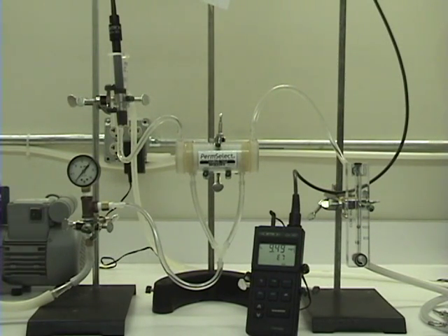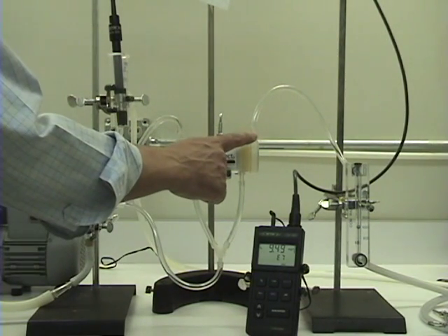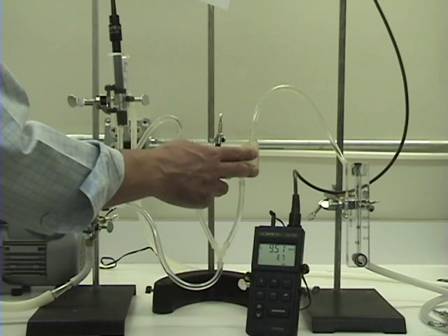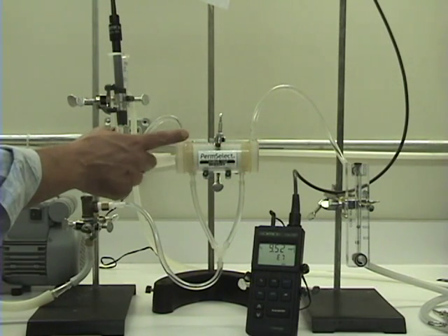This module is connected so that the liquid stream flows in the lumen of the hollow fibers and vacuum is applied to the shell side. Water enters at this port here and flows through the lumen of the hollow fibers and exits at this port.